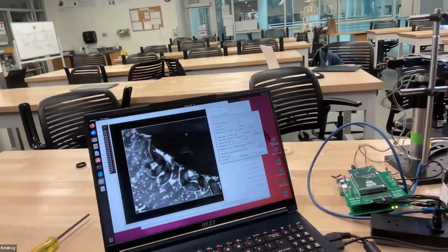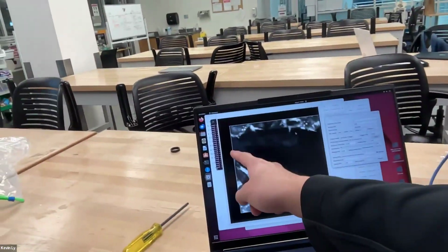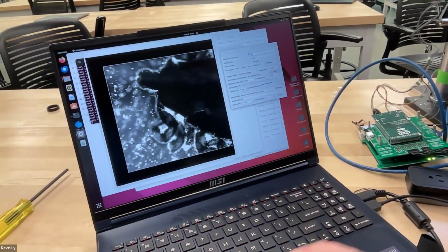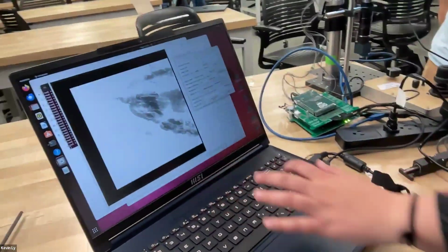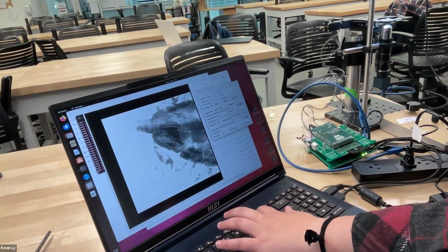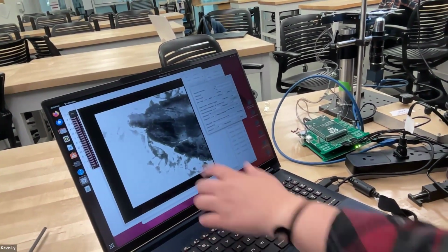You guys want to see a tick? Is that the head? There is. Oh my god. Let's see if we saturate this, if we can get... There it is. Look at that little proboscis. Was it on your backpack? It was just on my back.